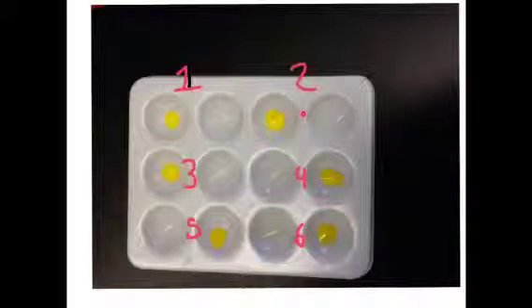So that one, that one, that one, that one, that one, and that one. And these are all supernatants of each. And then we added sodium iodide to this one, this one, this one, this one, this one, and this one.